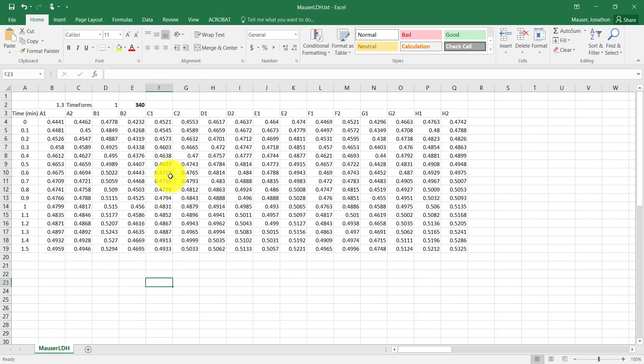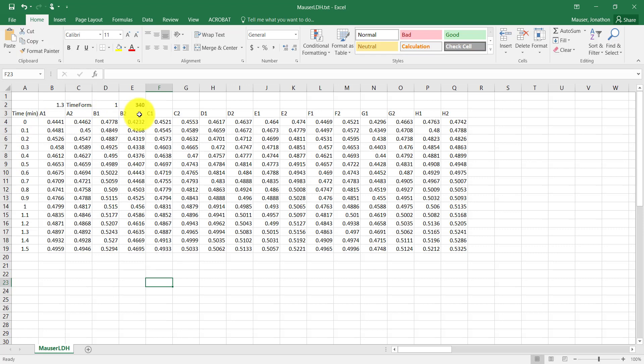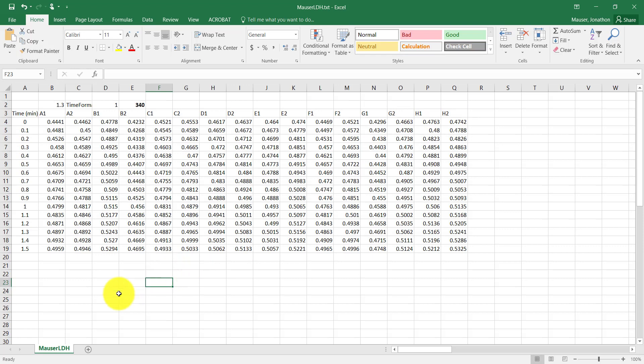So that looks really nice. Now, what we could do here would be to plot all of this out and get 16 plots on the same plot. Find all those linear equations and average them and find the slope. Which would be a mess.